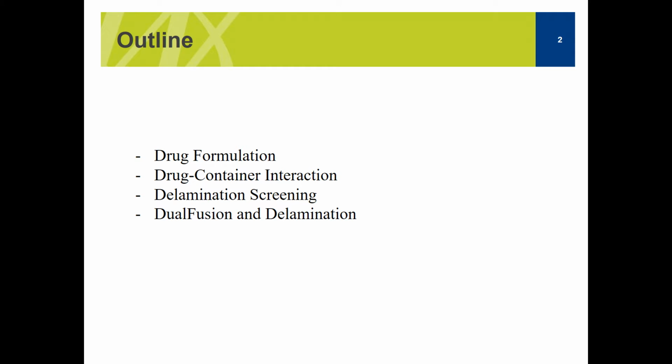So again, this module is going to be a continuation from module 1, and today we're going to be taking a look at delamination, but we're going to look at it from the drug container interaction. So we'll be talking about drug formulation. We're going to look at the drug container interactions, different mechanisms of delamination screening, and also DualFUSION and how DualFUSION helps and eliminates this problem of delamination.